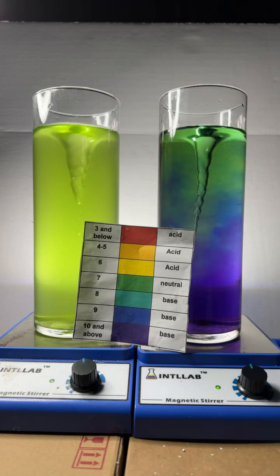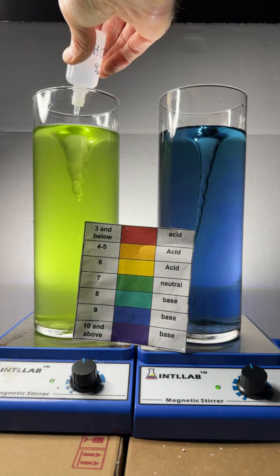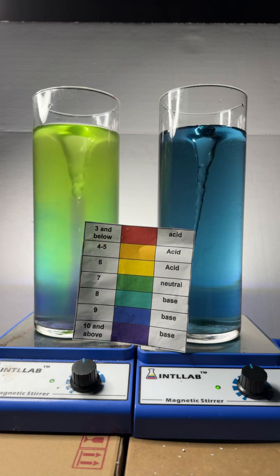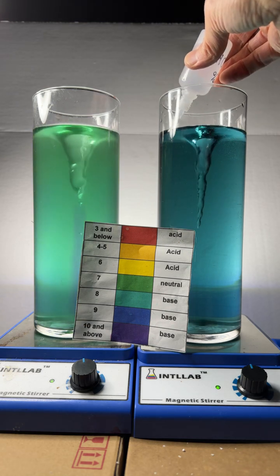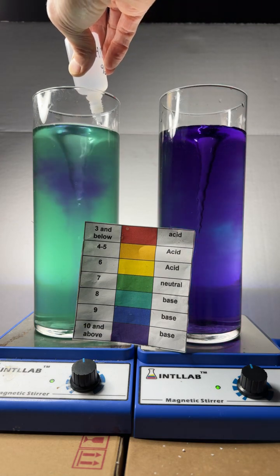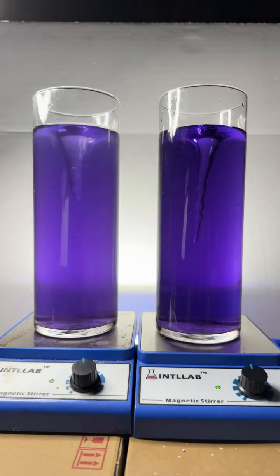That violet color you see is telling us that the pH is up as high as 10. We'll do the same thing over here on the left, and sure enough we see that same violet color develop. Looks like our pH has reached about pH 8 over there. On the right I'm going to go ahead and add a bit more base to try to get that pH up a bit, same over here. Look at that gorgeous violet color — absolutely beautiful.